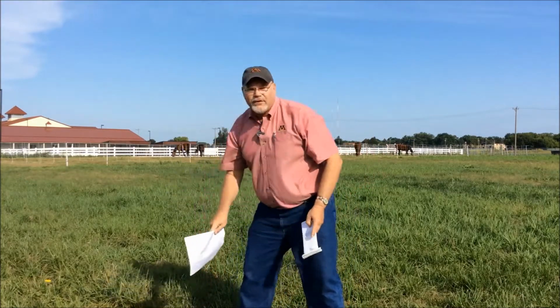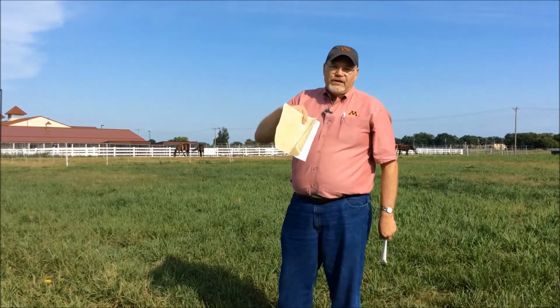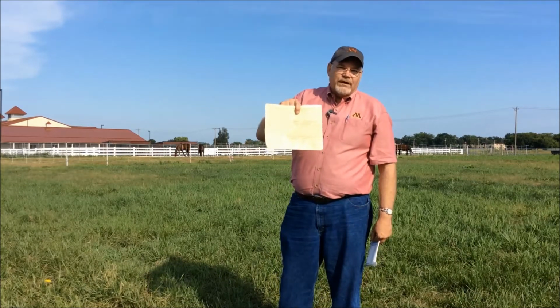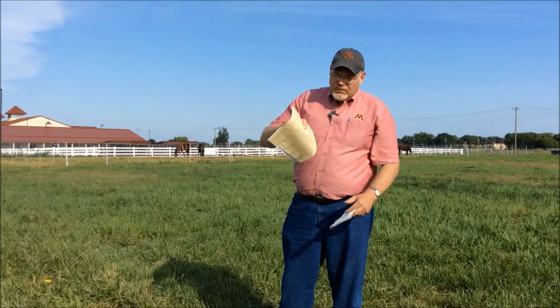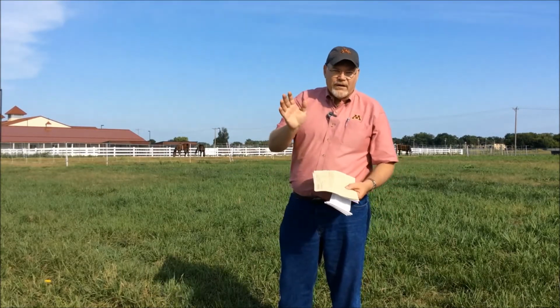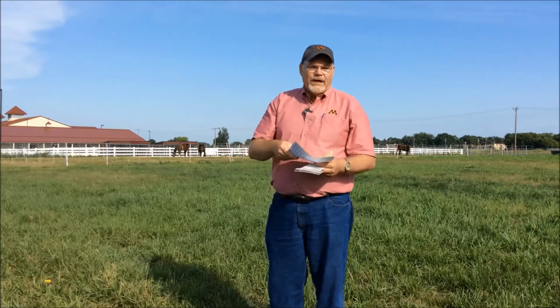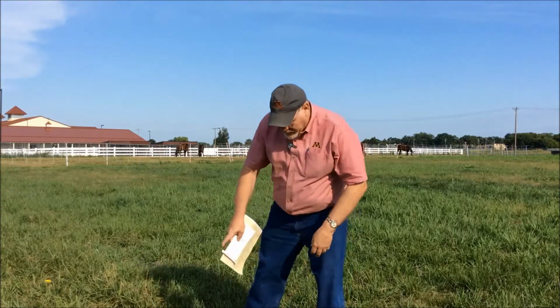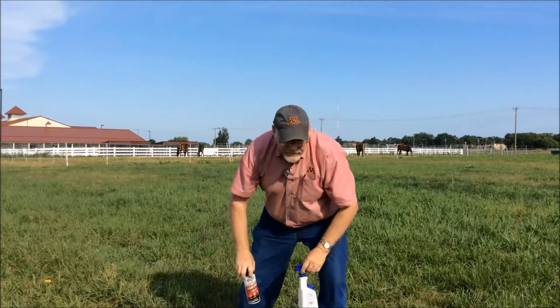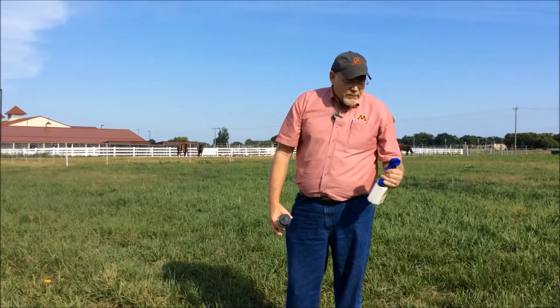And finally, when you've gone to the lab to get the bags, you will get a sheet in which to check the samples in. And on that sheet, you will tell them the history of the field. You will tell them where you're at. You'll give an identification number to it, and you'll tell them what crop you want this recommendation for.